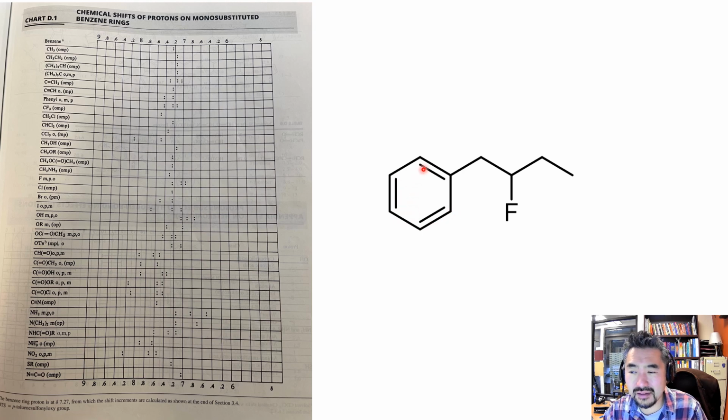So likely, if you took the proton NMR of this, all these 5 protons are probably collapsing or overlapping around 7.18 ppm. Some of these are a little bit more interesting to think about. For instance, if you have bromobenzene, let's say, at the ortho position you get the biggest influence because it's the closest to the bromine, right?